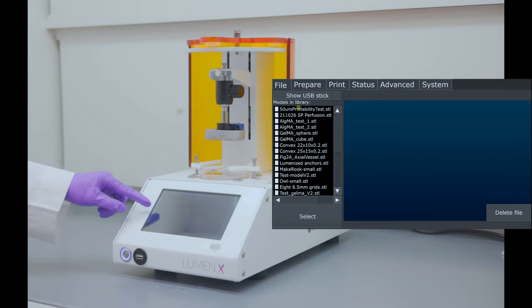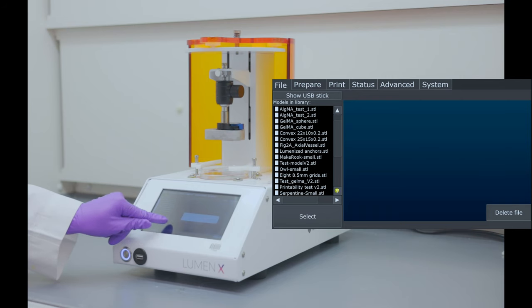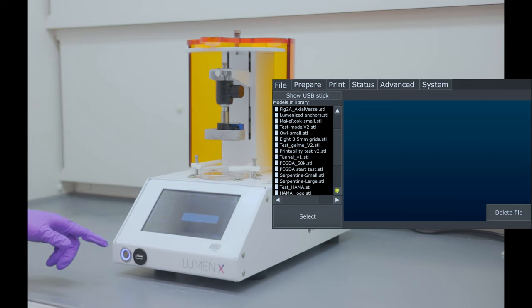We can scroll through the library to find the object we want to print. Tap on the scroll bars to navigate as needed. We can import STL files to the library using a USB flash drive.